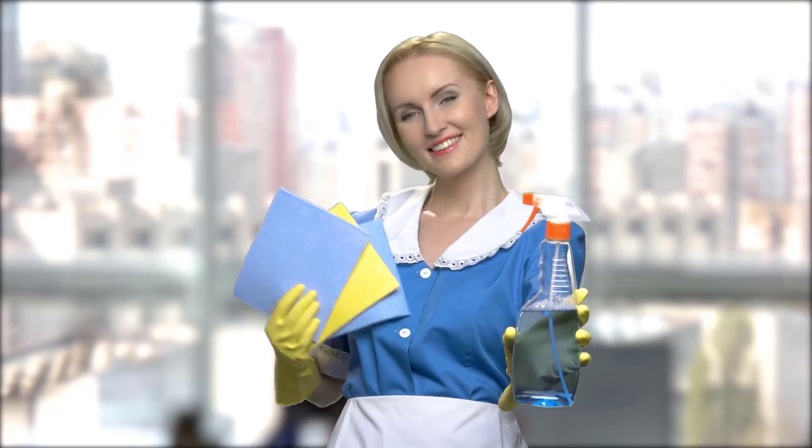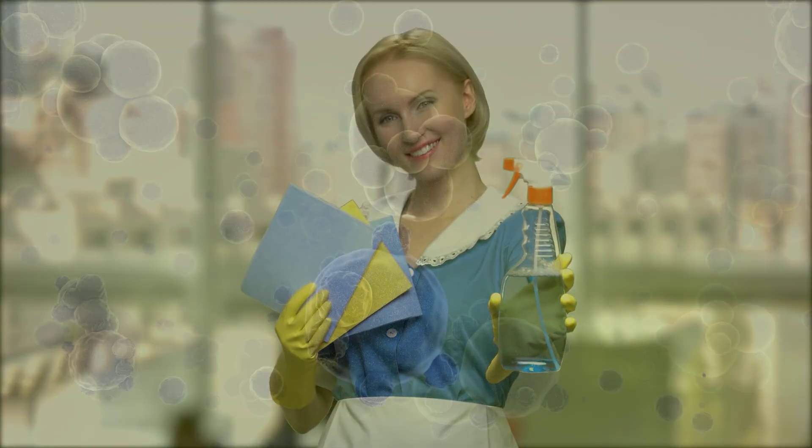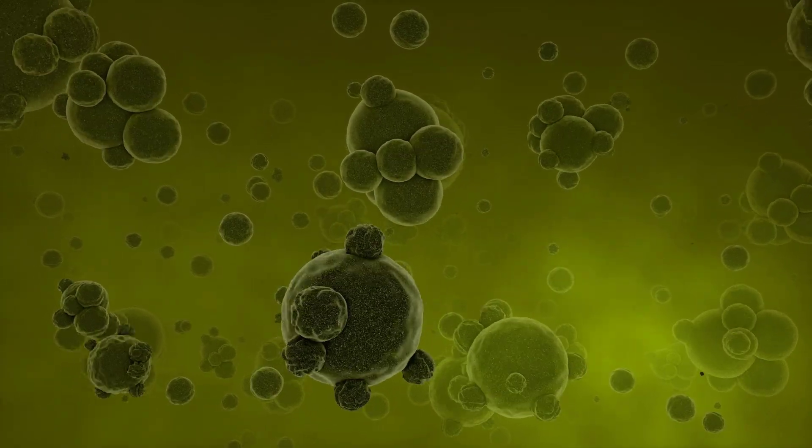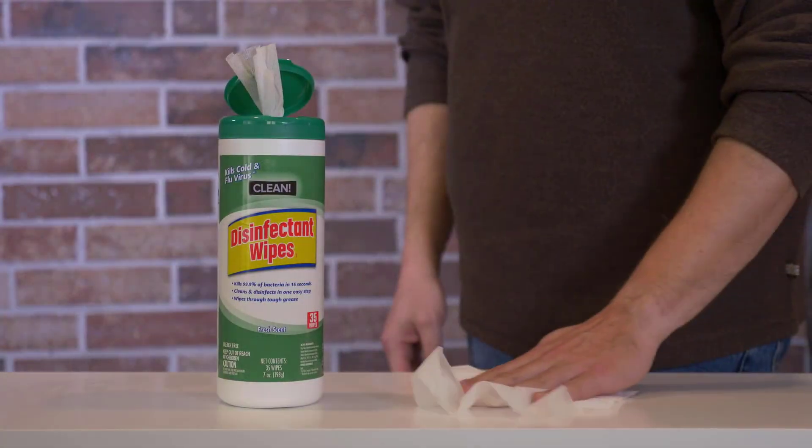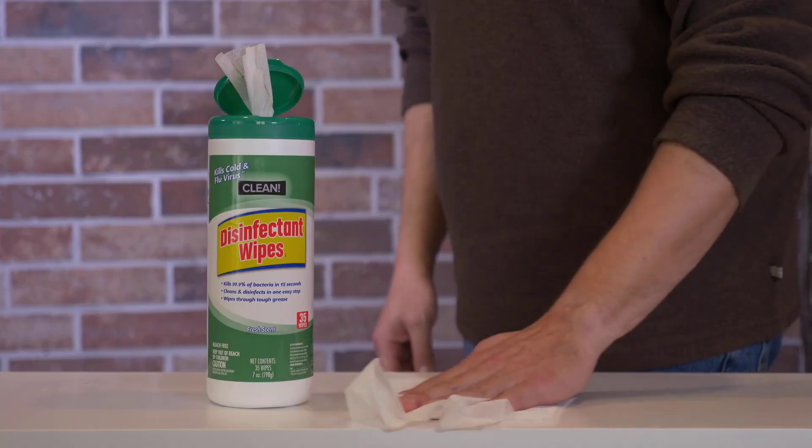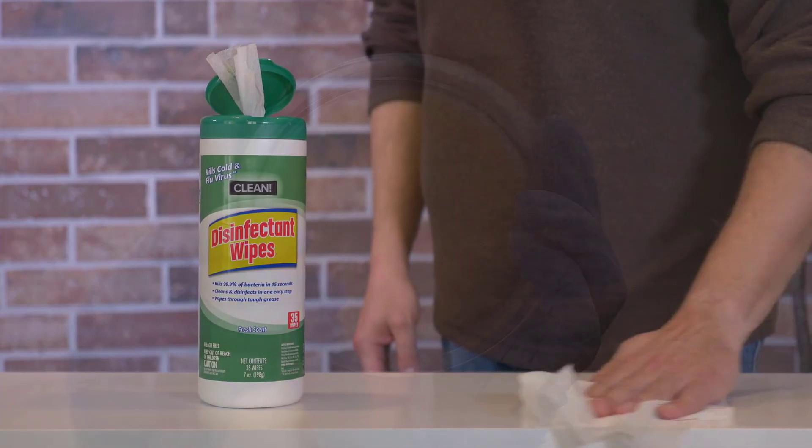All these products are antimicrobial agents. Different kinds of bacteria are sensitive to some chemicals and insensitive to others. Thus, different types of antimicrobial agents vary in the way they affect bacterial growth.